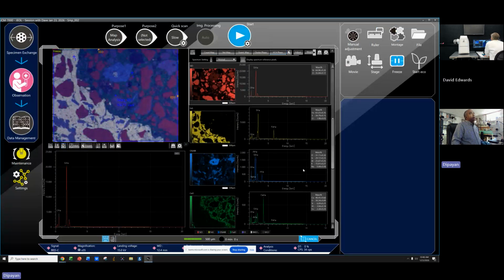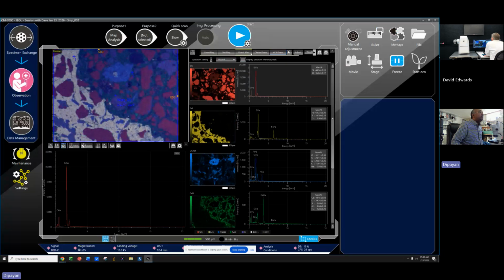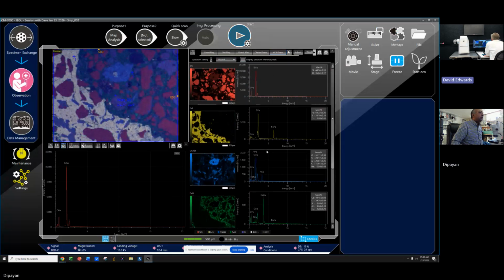But the VCA is also like a phase map. Oh, no. I didn't want this. I thought VCA is the same as the elemental map. No. VCA is much like cluster phase. So cluster draws a hard line in the sand, if you will. And VCA acknowledges that there are gradients at the edges. And so instead of giving you a hard line, it actually shades the different phases. So really bright is strong in that phase. And then as it approaches another phase, that gradient drops off.